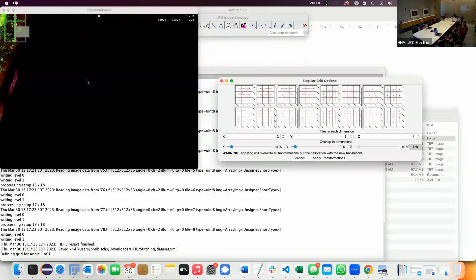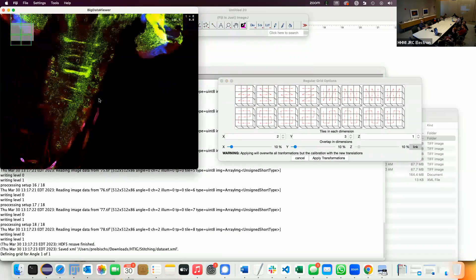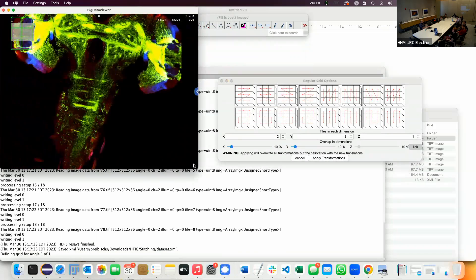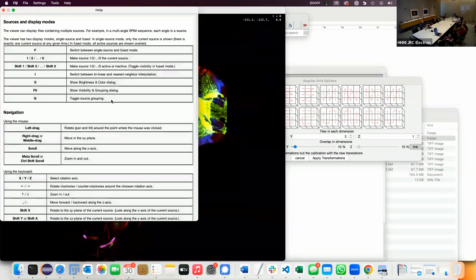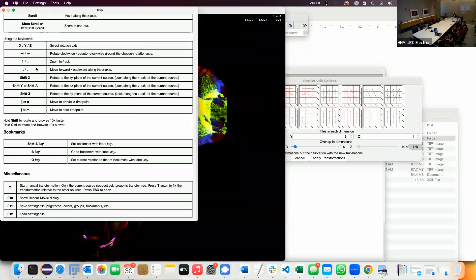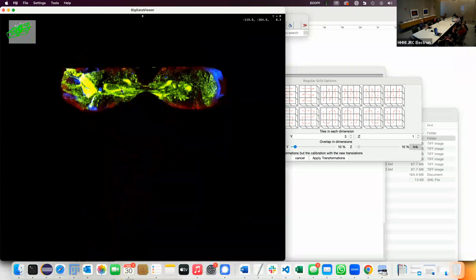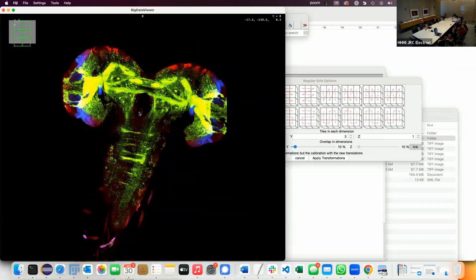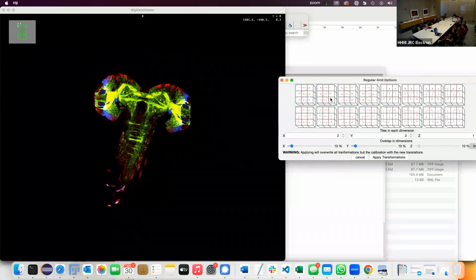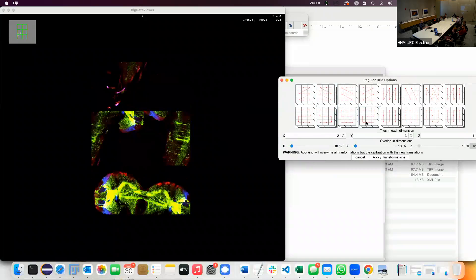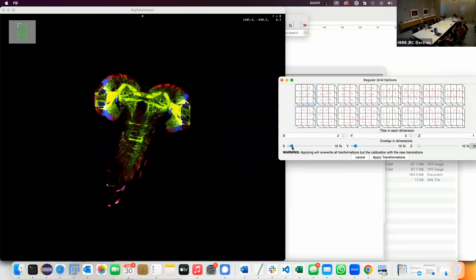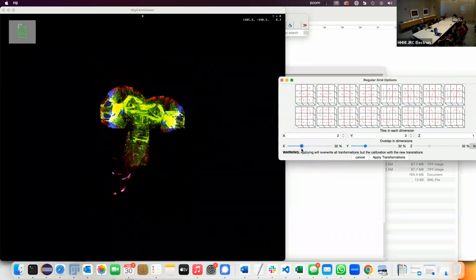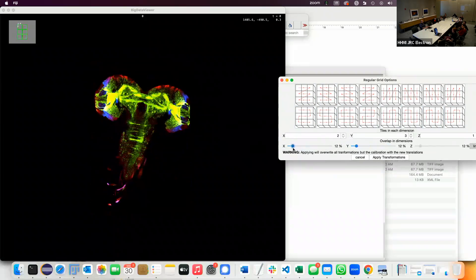Then you get this back — you have your overview here. I'm not going to go into how to use Big Data Viewer in detail. If you press F1 here you get the help for Big Data Viewer — how to navigate. You can also look at it from the side and make sure things are okay. It basically allows you to interactively assemble these tiles. If you have no idea how your acquisition is done you can change this and make a good guess of how to start.